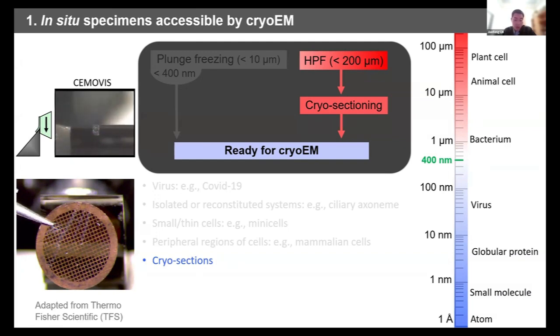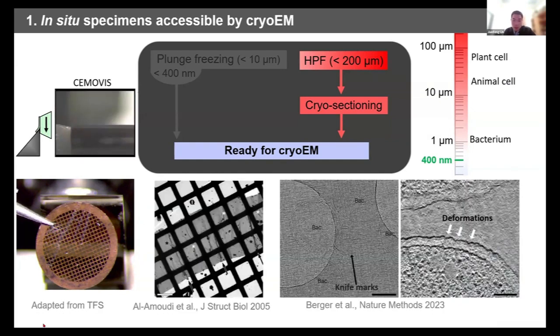These samples are good because the sample is still in a native or close to native state. However, the cutting process brings lots of artifacts.